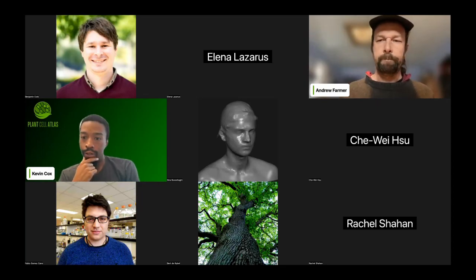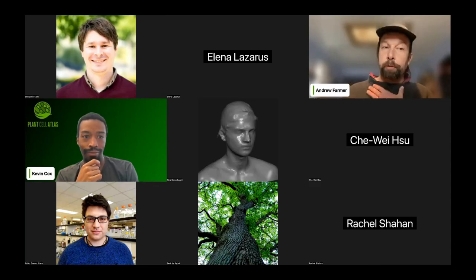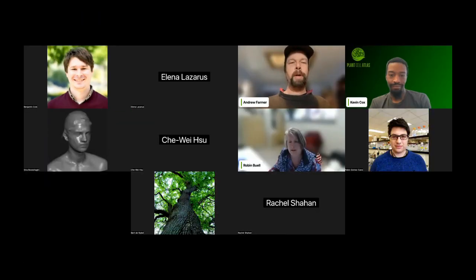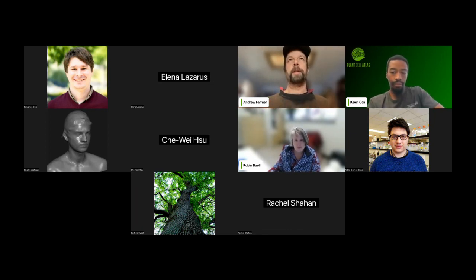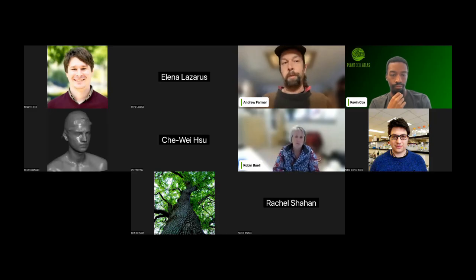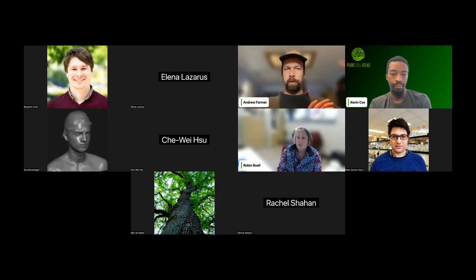Gotcha. We have another question that asks, can you provide more details about CellBender plus ATAC-seq? A very little bit of detail. If you go to their GitHub, you'll see that there are some issues open about whether or not it's appropriate. Basically, I think the overall idea is that you probably aren't going to get a lot of ambient noise from ATAC-seq, but this other phenomenon that they address in their model, which has to do with barcode swapping among the cells, they do think it's appropriate for that based on some of the other phenomena that they've looked at. And so they allow you to apply the model with different parameterizations that allow you to turn off the ambient and only look at the swapping. And so that's the direction I'm going to be starting to look at it in.